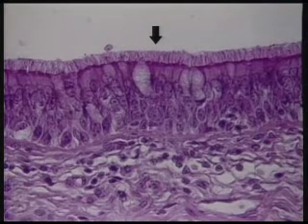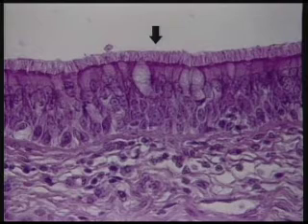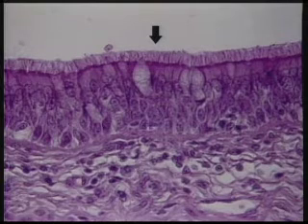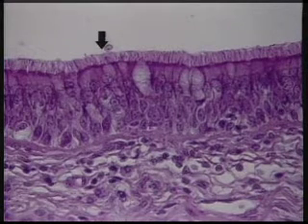We're now going to move on and look at specializations of the cell surface. The cell membrane takes many forms, and at the surface of cells it's very often highly modified. And one kind of cell surface modification or specialization that you'll be looking at quite often in your study of microscopic anatomy is the cilium. And when a lot of cilia are together, you very often have an image that looks something like this here.